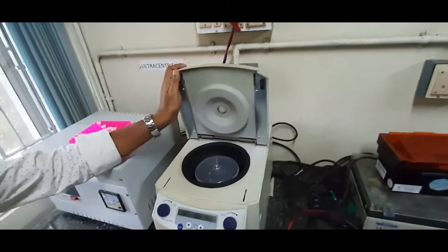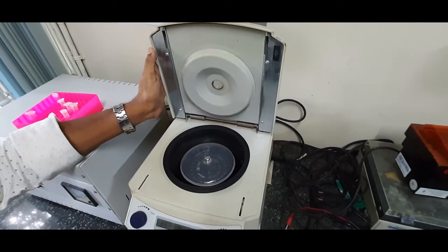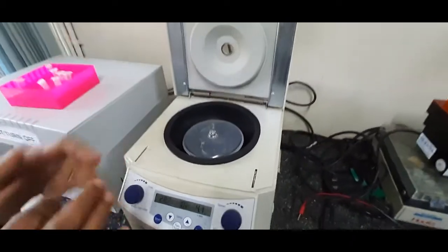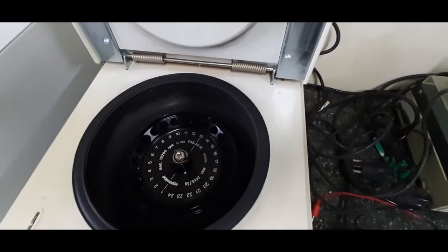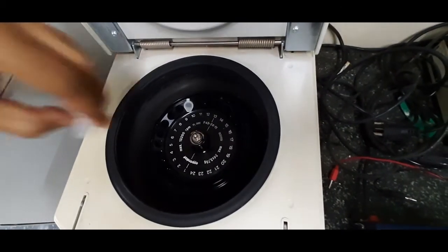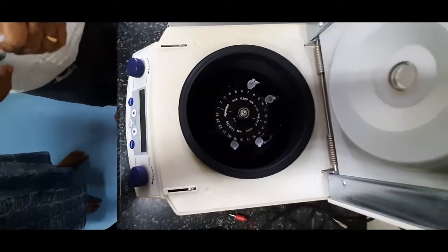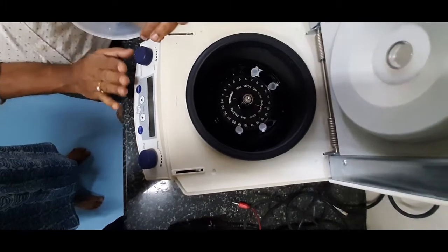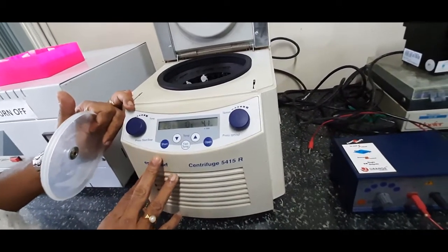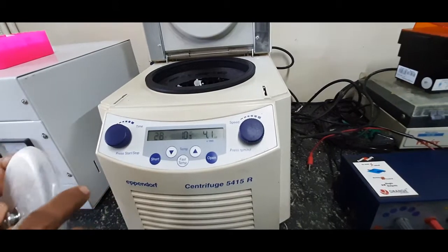This is a cooling centrifuge. Whenever you handle nucleic acids and other macromolecules, you should always work at a lower temperature in order to minimize the impact of nuclease enzymes. Just like a centrifuge, you have a central rotor and sampling slots — tube holding slots — where you place the microcentrifuge tubes. Based on how many samples you have, you place them accordingly. You can set the temperature and the speed — usually around 10,000 RPM for the concentration of microbial cells. You can vary the speed as well as the time.